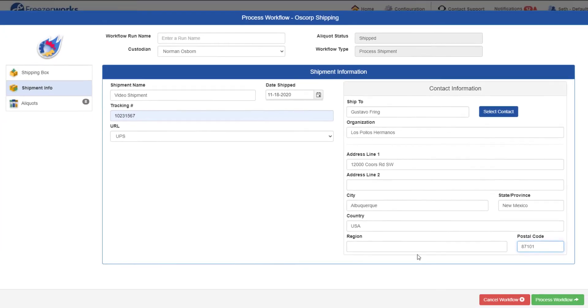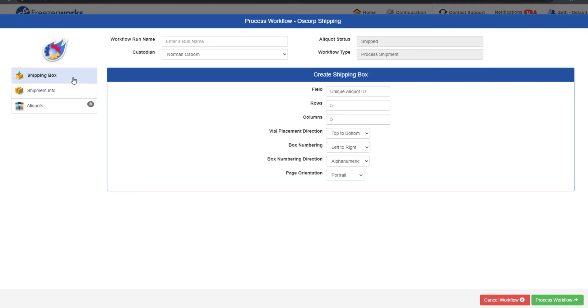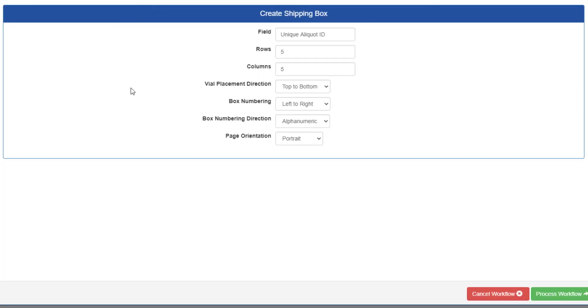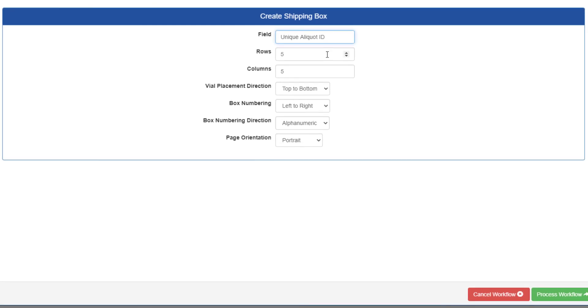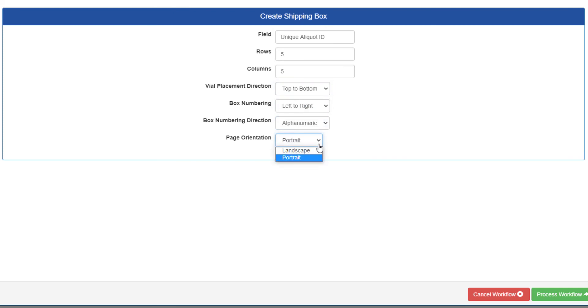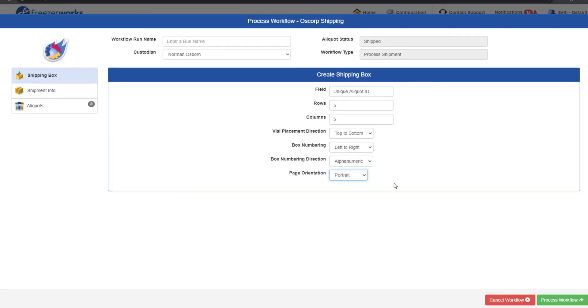Now that we're finally doing a shipment workflow, let's talk about the shipping box page. The shipping box is a printed visual manifest of the aliquots you're shipping, so this page is where you design the structure of it. Determine the field you want displayed on each aliquot, the number of rows and columns in the box, the direction the vials are placed, how numbering is done, and the page orientation. That's all there is to a shipment workflow, so let's process it.